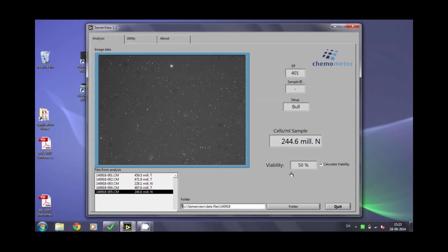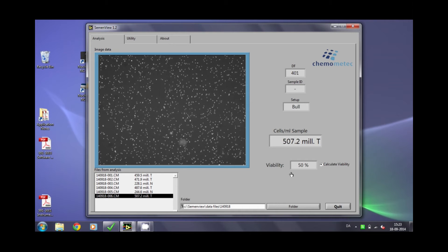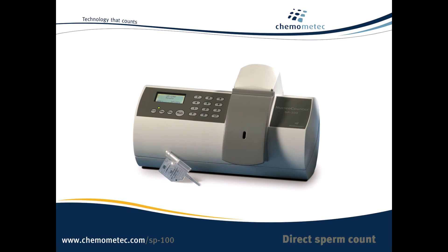In 30 seconds, the instrument shows the total cell count in the display, expressed as million cells per millilitre. If the instrument is connected to a computer running the SemenView software, the measurement result is shown on the screen and the results stored on the computer. In a total cell count, all cells are counted, whether viable or non-viable.